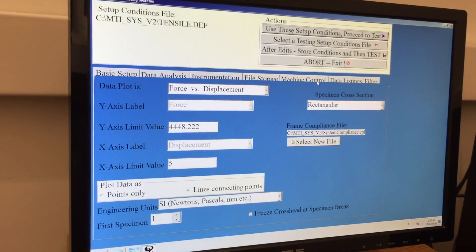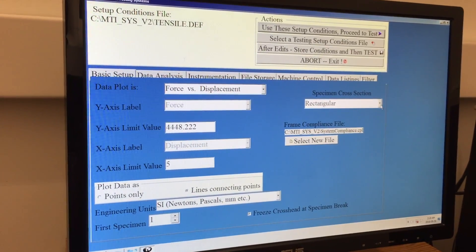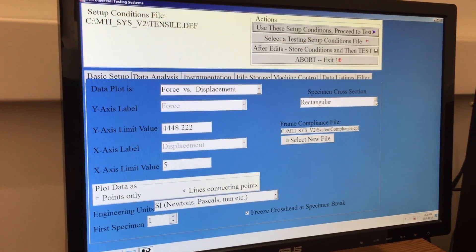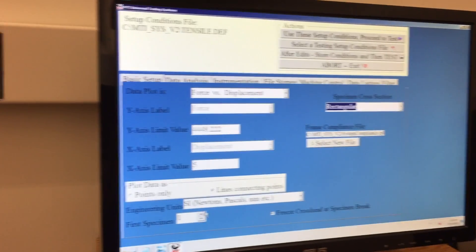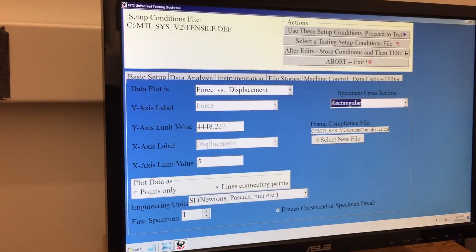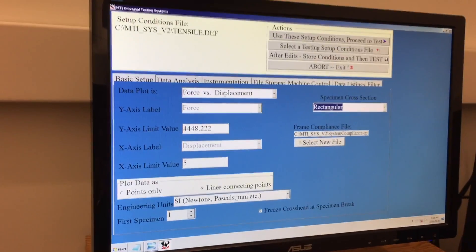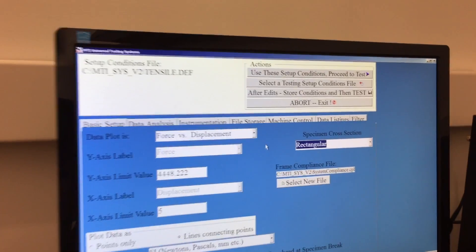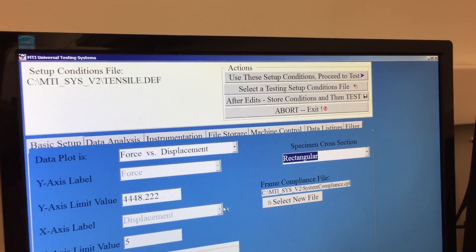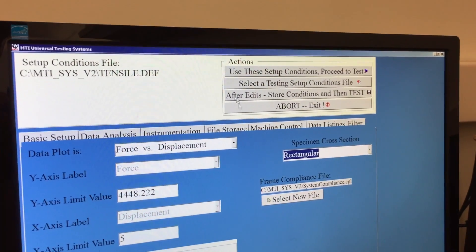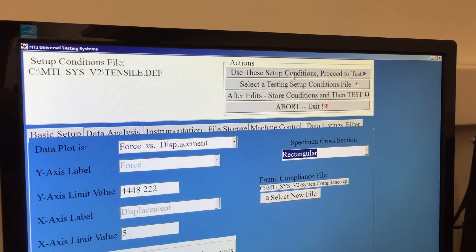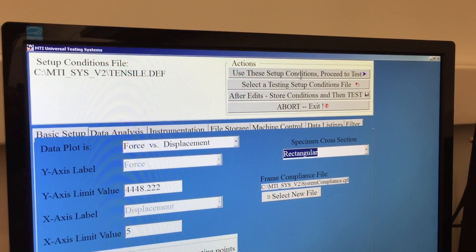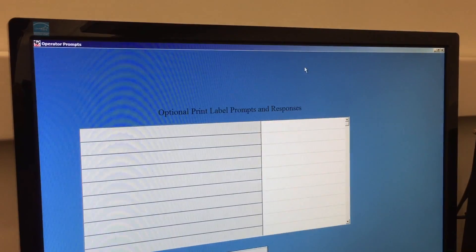The only thing you may need to make sure is changed is the cross section is set to rectangular versus circular and that your units are in the proper ones you're looking for. If you're happy with the setup, you can use these setup conditions and proceed to test.